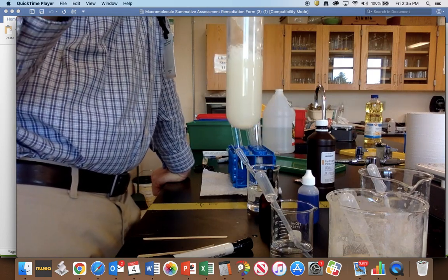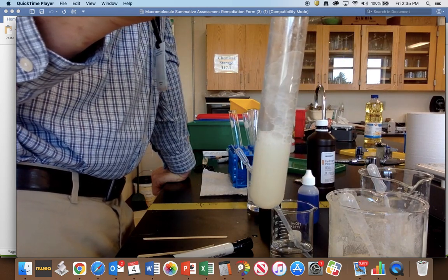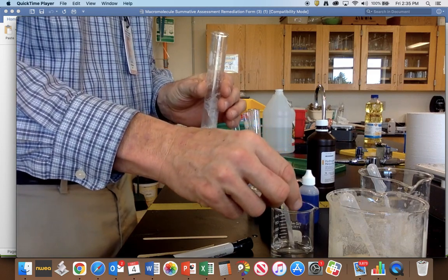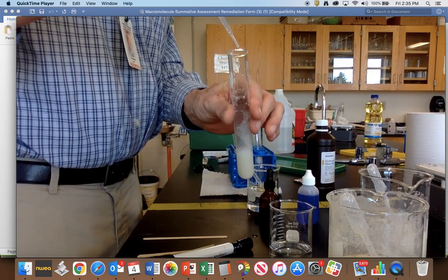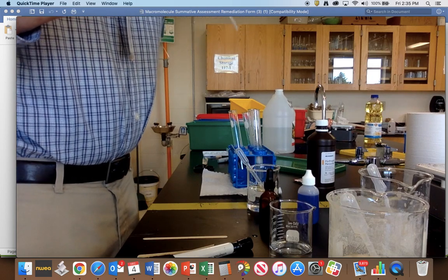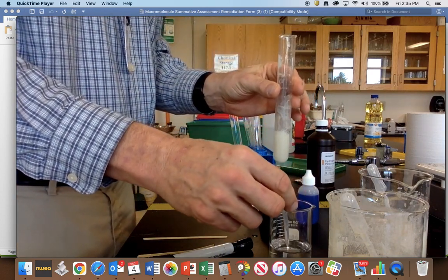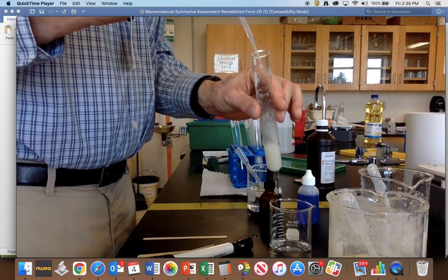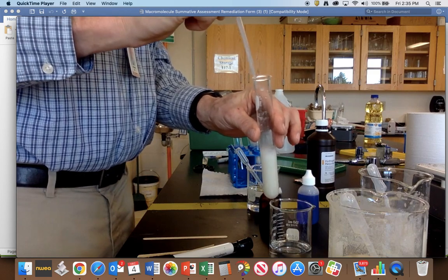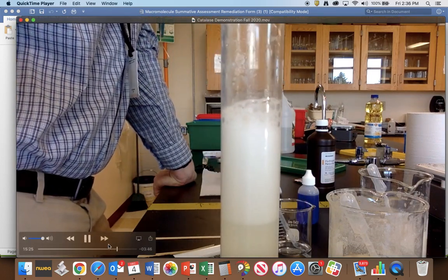And there's our original one, the one we started with the good yeast and putting hydrogen peroxide in. Notice that the reaction's basically done. Those bubbles at the top are just left over from the previous reaction, but the reaction's stopping. So we can add some more substrate. If we add more substrate, we should be able to see that the reaction continues to occur because the enzyme's not used up by the reaction. We'll add a little bit more. There we go. So that's showing the enzyme was not used up by the reaction. And so that demonstrates that property, that enzymes are not used up by the reaction. They're still available.